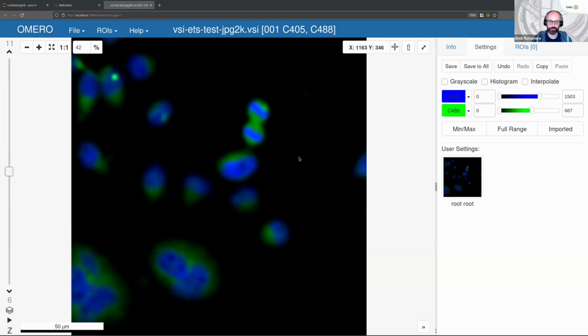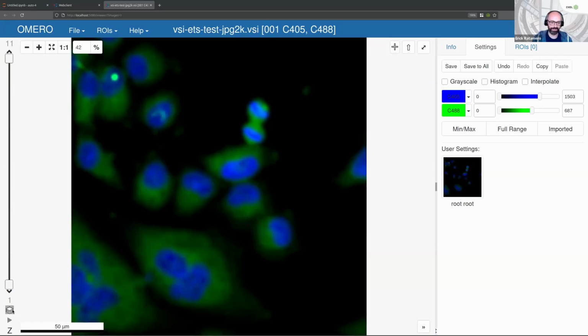File size, not really. In general, if you have very large data, everything is slower. If I had a multi-gigabyte image and tried to create a Z projection here, it would probably take a very long time to calculate. But intrinsically, no limitation on file sizes either.